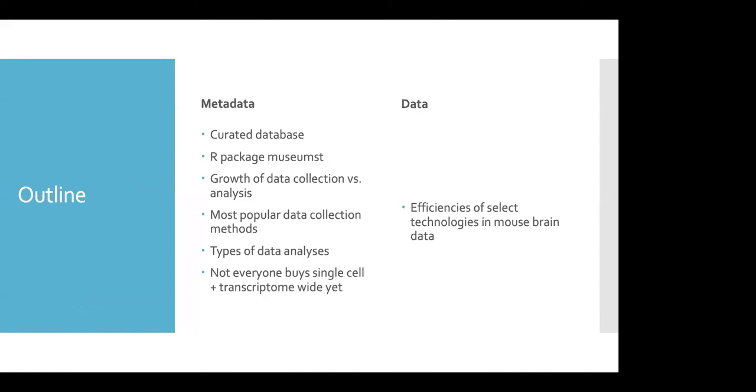In this presentation, I will show some highlights from the analysis of the metadata, as well as just a little bit about the data from different spatial transcriptomics technologies from the mouse brain.